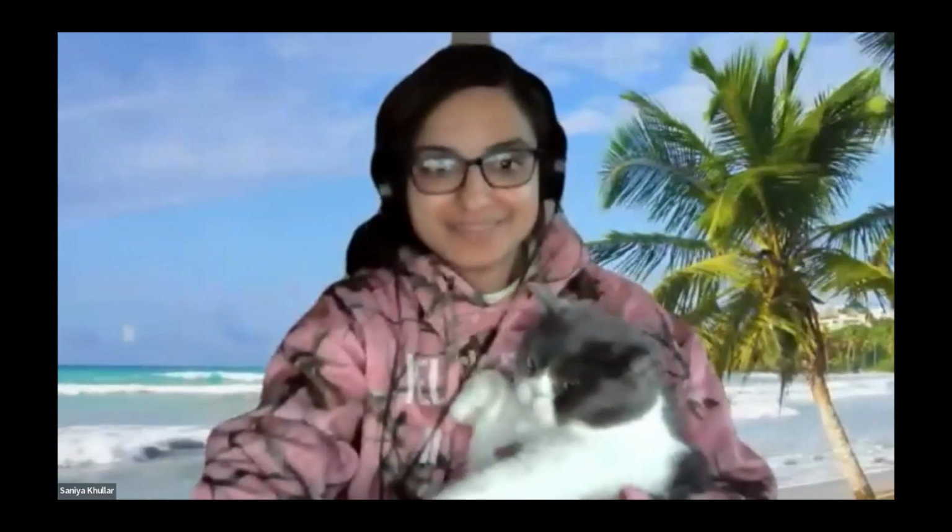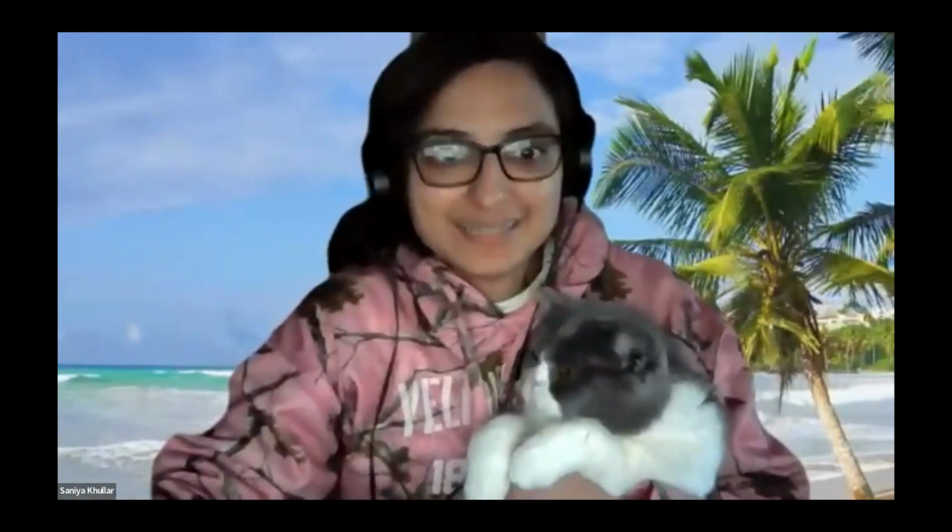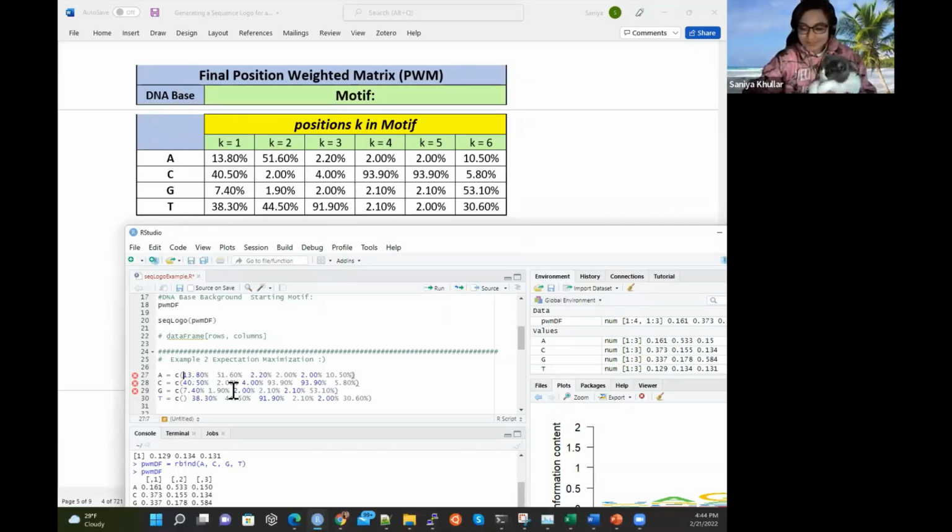Basically, just try to put them in R. That's what we're going to try to do. So Yankee's going to be helping a bit. We have to do this quickly because we can't really have percent signs here.